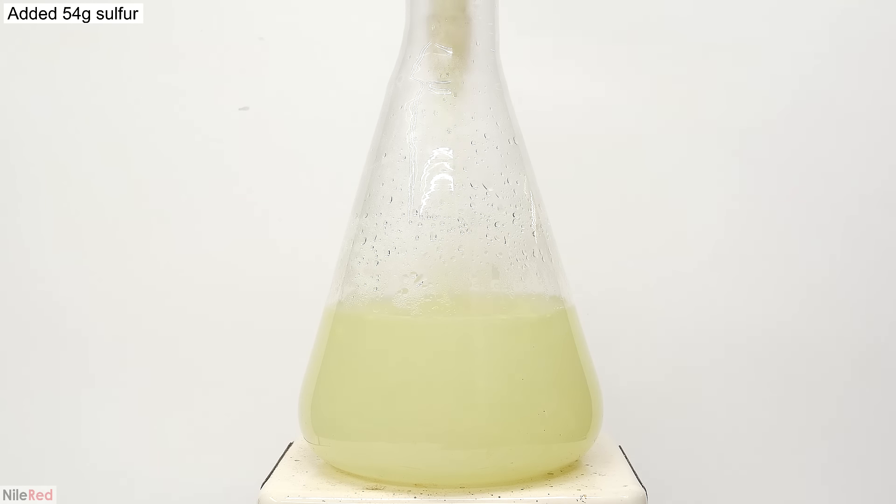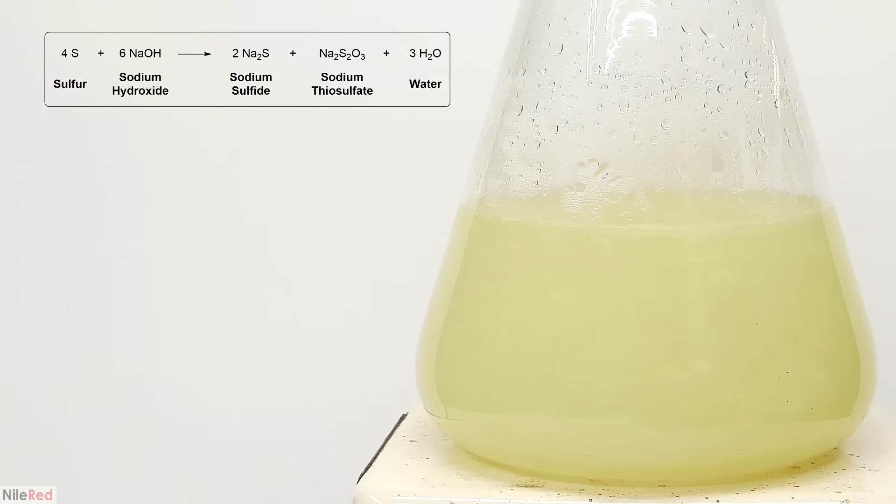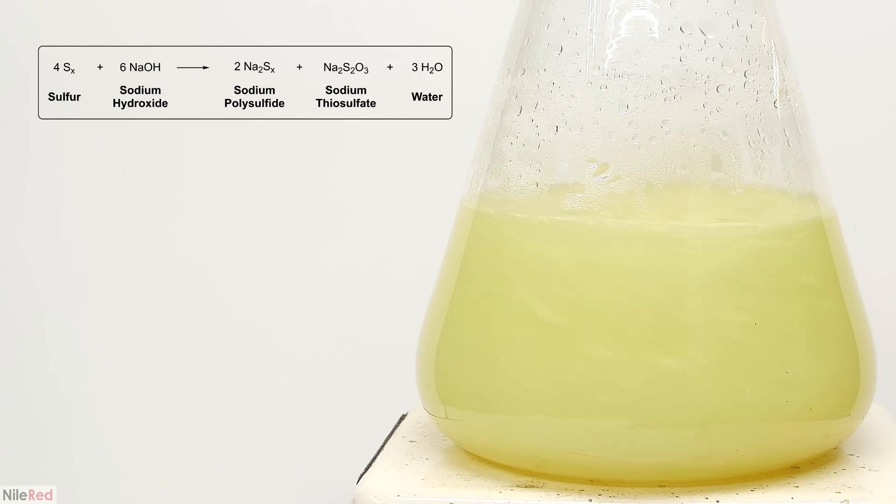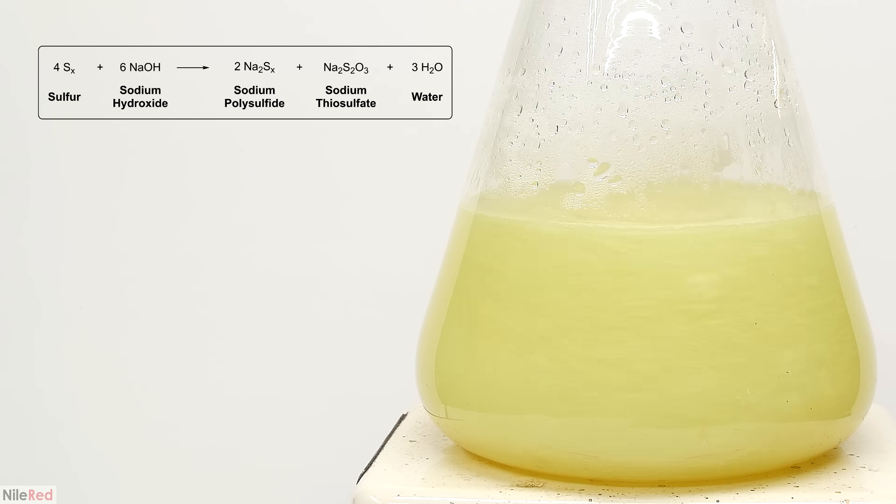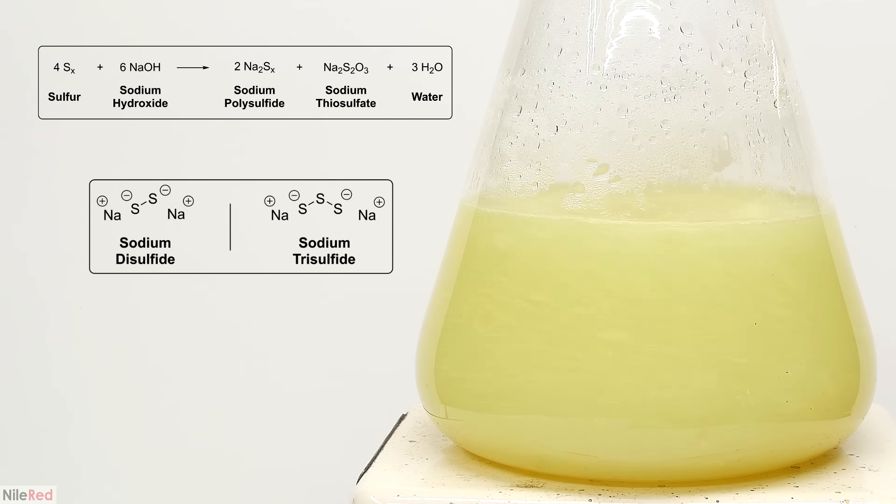Now it's time to make the polysulfide solution, so I start adding the sulfur. With excess sodium hydroxide, the sulfur reacts to produce mostly sodium sulfide, but it will also make some polysulfides. The polysulfides have the general formula Na2SX, where it can have anywhere from two to five sulfur groups. However, because I have such a large excess of sodium hydroxide, I imagine the polysulfides that do form are the shorter ones, with at most around two or three sulfurs.